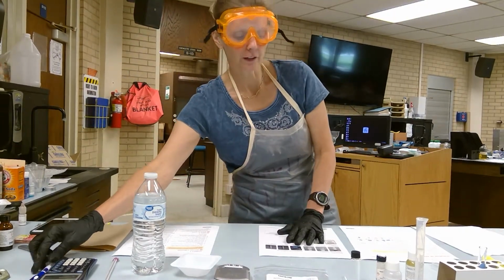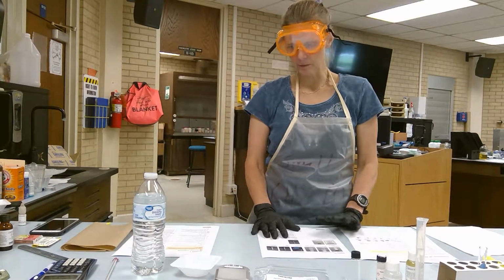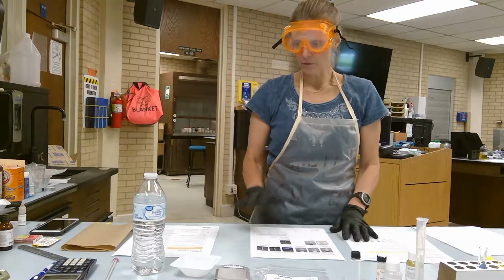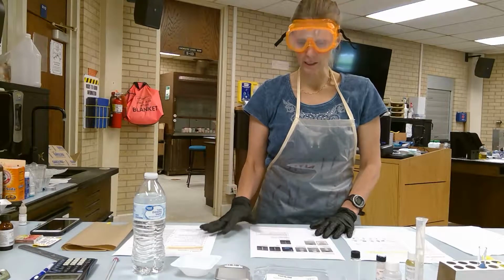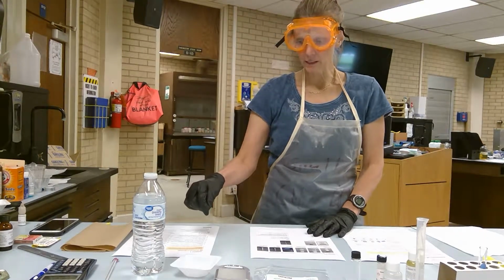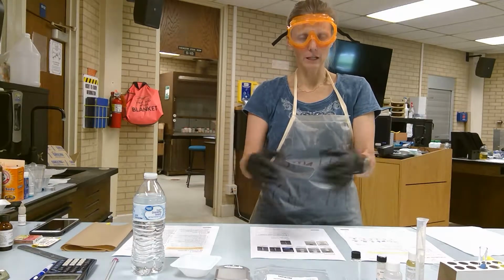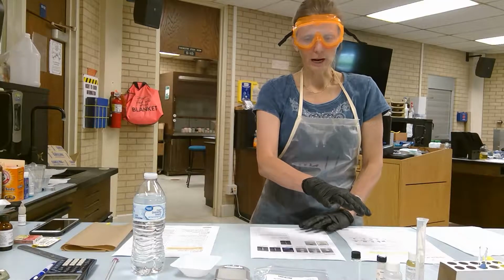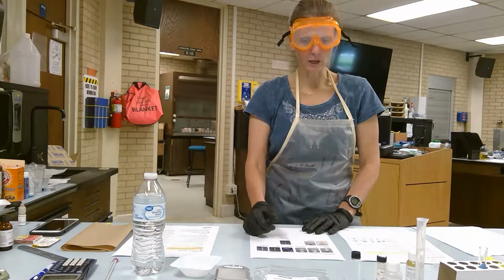I'm going to tell you up front that this particular experiment takes 2 days plus 60 minutes to complete, so make sure that you set up enough time, because before we can move forward with the second half of this activity, you will need to prep for 2 days. We're going to set up the beginning of the esterification, and it only takes about 10 minutes to start the process.